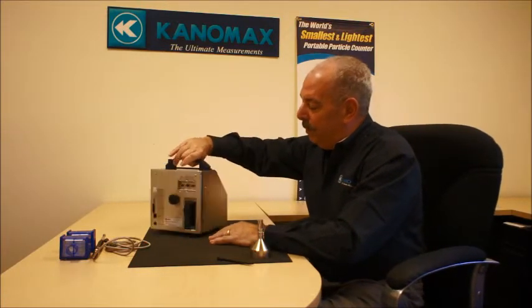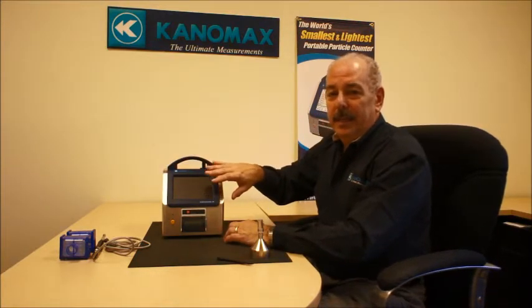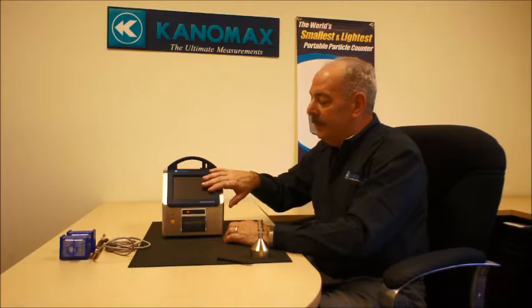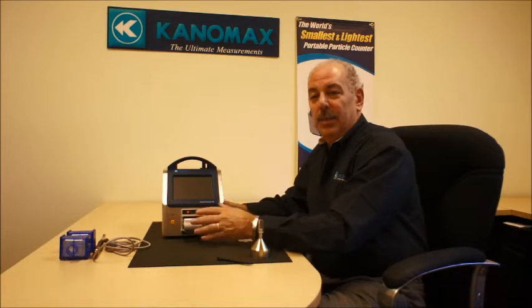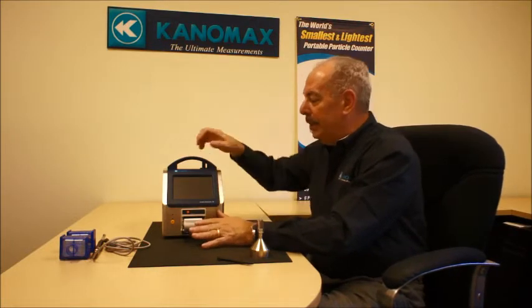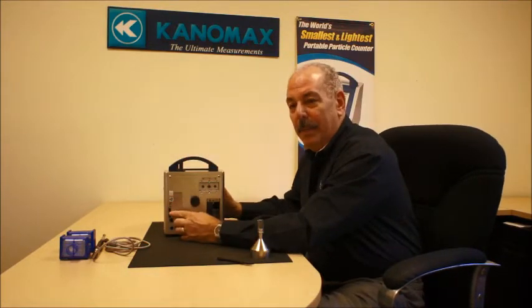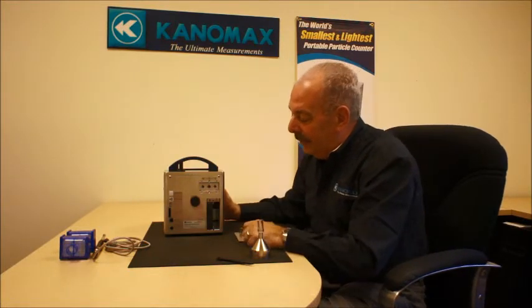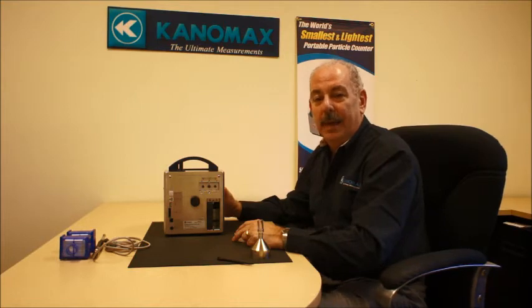The counter has a large 4.3 inch color touchscreen. It has a built-in thermal printer. You can actually store data internally in the instrument as well as print it on the printer, with the options of using an SD card memory slot as well as a USB flash drive. The unit itself can also be integrated into a LAN for remote operation and you can access data that way as well.